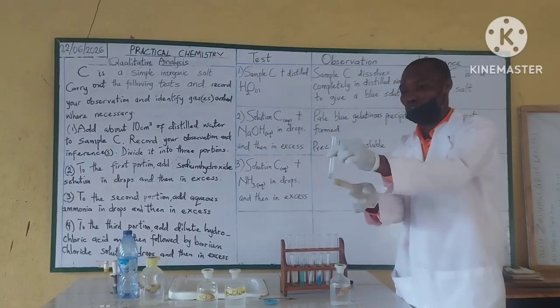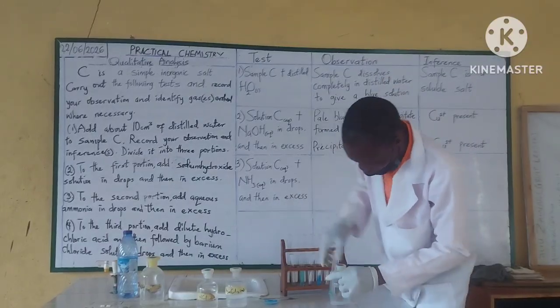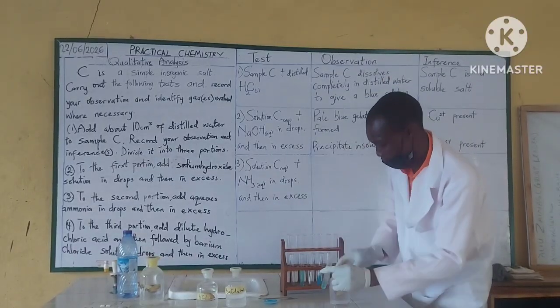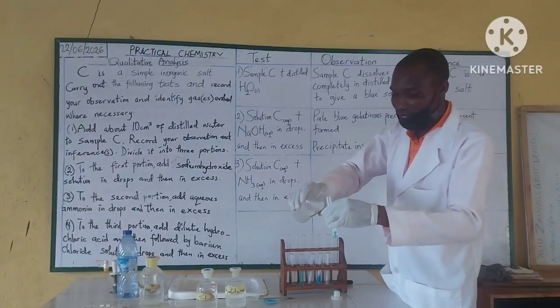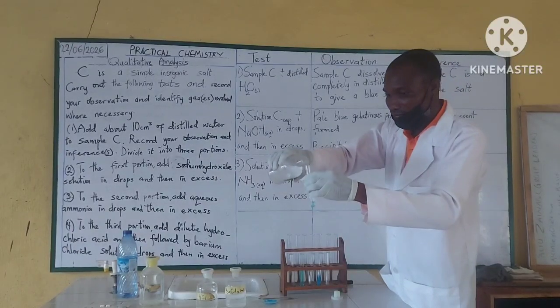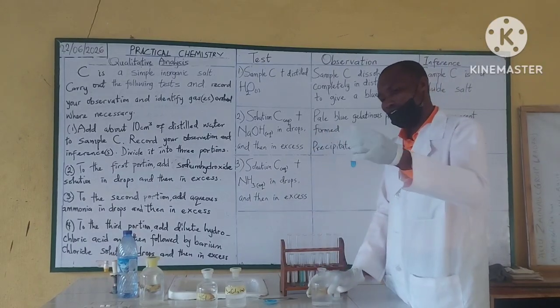They say small portion, use it. Now, we are moving to aqueous ammonia. Aqueous ammonia in drops. What do we have? Let's see that, in drops.